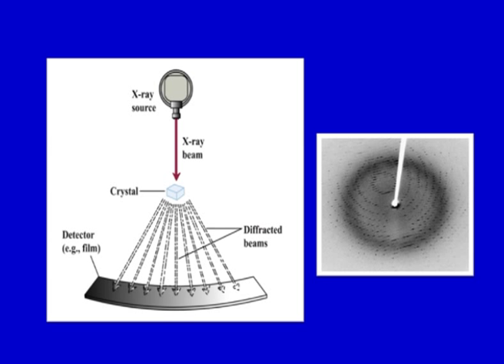Now, you can see this is the center, and as you go to the periphery, there is more diffraction towards this side, and more is the resolution that we get. It means the lower the value, if we say 1 angstrom resolution, then it is higher resolution. If we get 2 angstrom or 3 angstrom, then it is lower resolution. So, if two atoms which are closely spaced can be resolved, then it is higher resolution, and it is obtained when there is higher diffraction at higher angle.